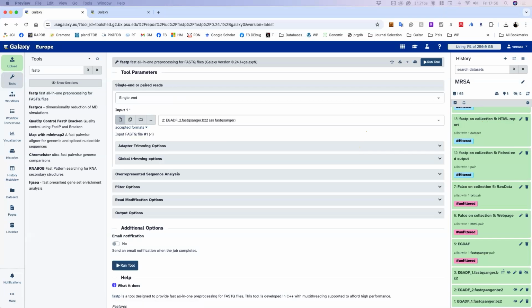Yes, I did. Oh, you did that? No, sir, I opened it, but not the sequence. I mean, that process, I didn't follow.